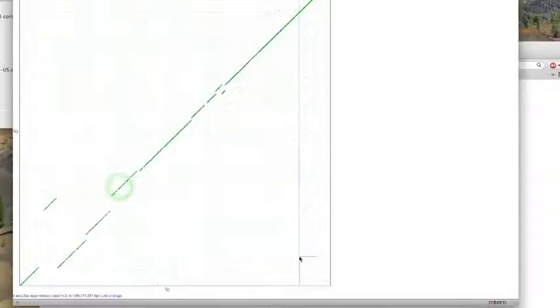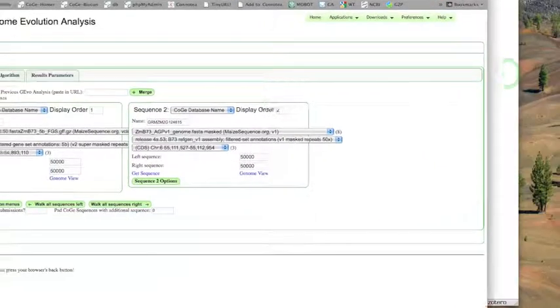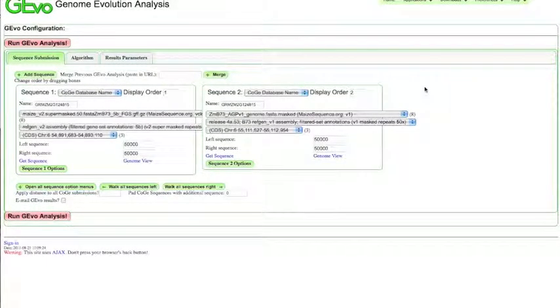between the two assemblies. Now, this relatively high degree of concordance between maize versions is due to the BAC-by-BAC sequencing approach that was used for the maize genome. However, within each one of these BACs that was shotgun sequenced, there are many changes that have occurred. In order to visualize these, you can use the crosshairs and move over any region that's syntenic. When the crosshairs turn red, this means you're on top of a syntenic gene pair, and when you click on it, it will launch CoGe's tool GEvo that permits high-resolution analysis of two genomic regions.